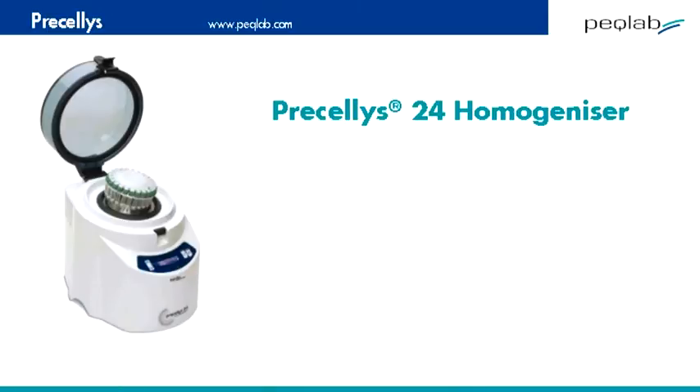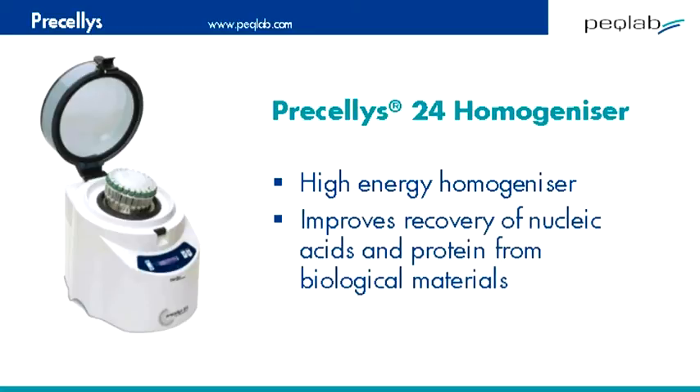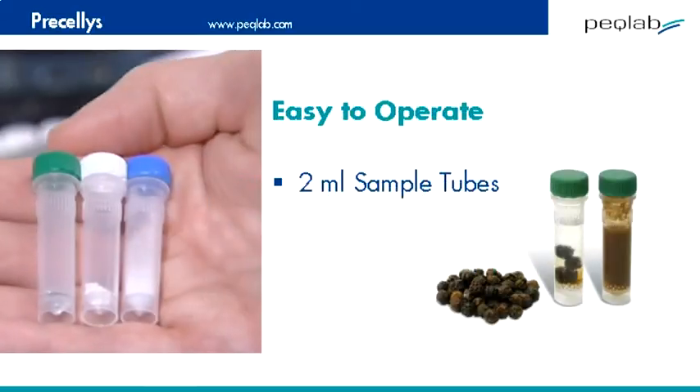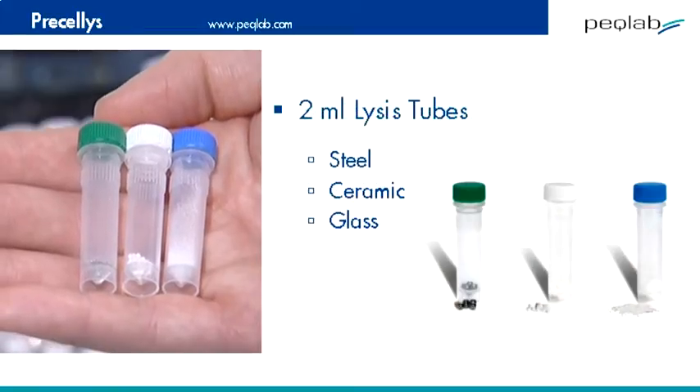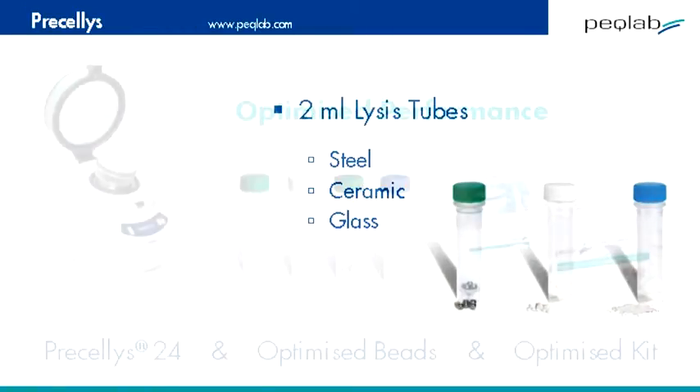This is a short demonstration of the Pracillis 24, a high-energy homogenizer using bead beating technology designed to improve nucleic acid or protein recovery from biological materials. The system uses 2 ml tubes filled with grinding beads — steel, ceramic, or glass — and is fully optimized with Peclab purification kits.